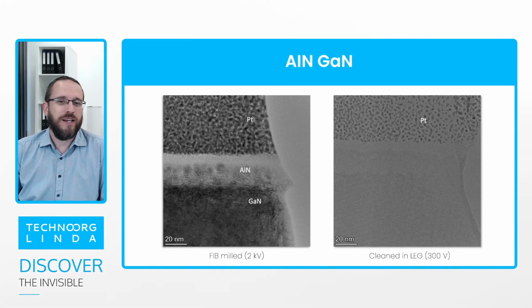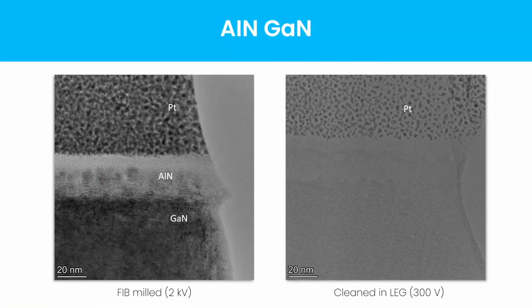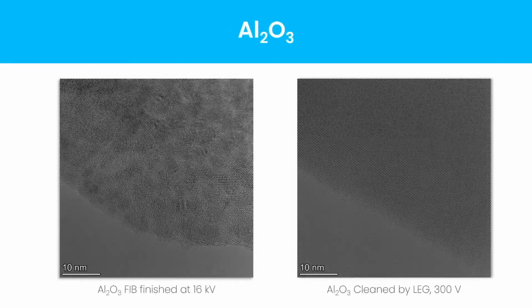Also, if you look at the lattice image, which gets very, very weak actually when you get a thin sample, but maybe you can lean closer to your screens and have a look at the lattice image. That is a very good quality lattice image. You can see separate aluminum nitride columns. If you look carefully, you will also see some dislocations within the gallium nitride.